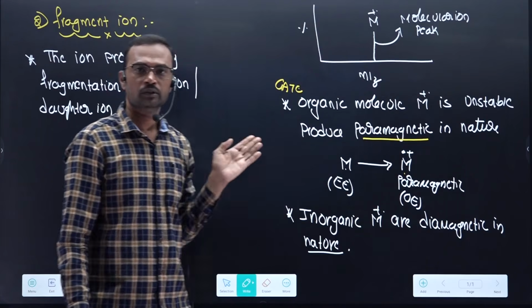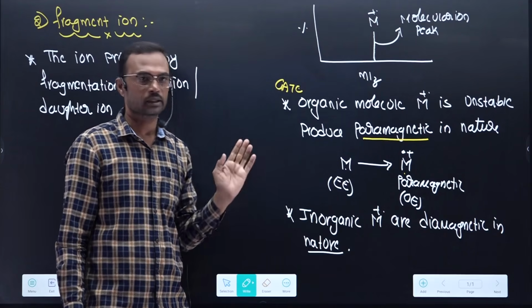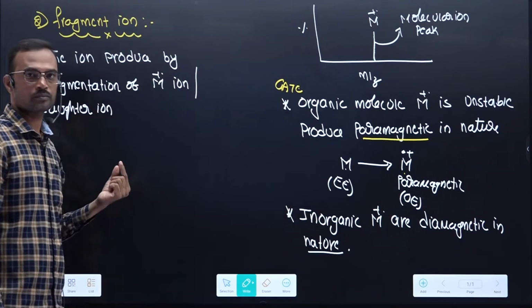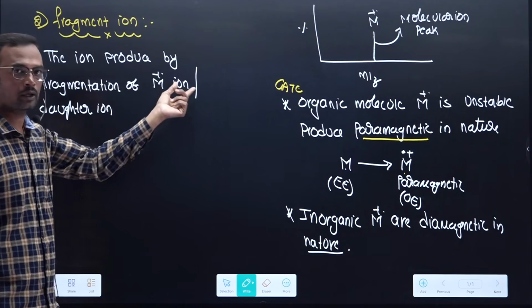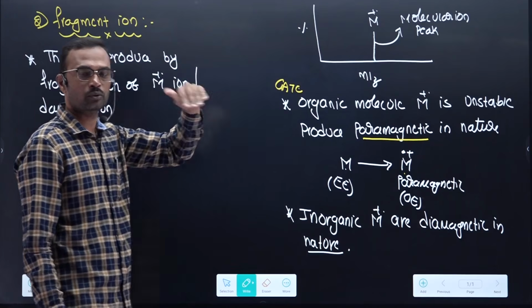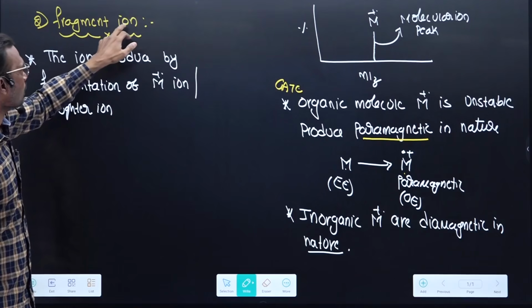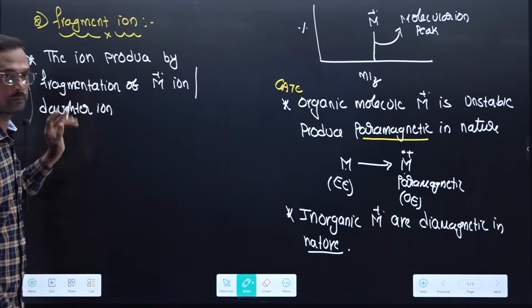Yesterday we were given with an m/z value 58, then followed by 43, 29, 15, like that. So every time the molecular ion will not give all kinds of ions. Every time the molecular ion is responsible to give one ion. That ion undergoes further fragmentation. Regularly it keeps on progressing to give variable ions that will give structural information. So I can say that fragment ions are produced by the molecular ion as well as the daughter ion.